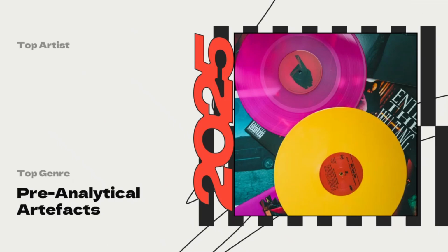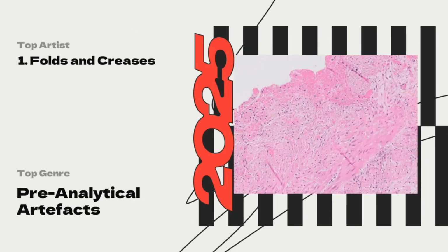We have a little look at some of the pre-analytical artifacts that we've had submitted. So number one is folds and creases. I did use that as an example because it is something that we need to start considering the quality within our labs. So something as simple as when you first become a BMS or you first start using how to use a microtome, just going that little bit slower, just getting some nice sections. It's just really important to feed back to our labs how important that just foundation step of histology actually is for the downstream processes that we're wanting to use.